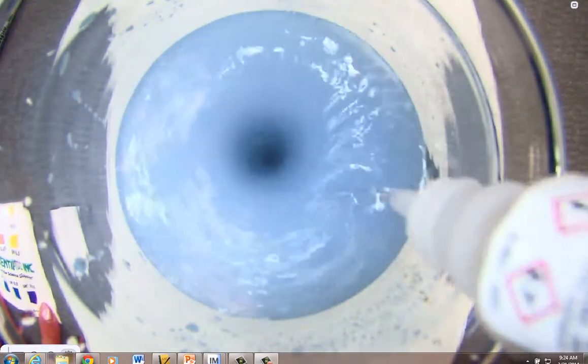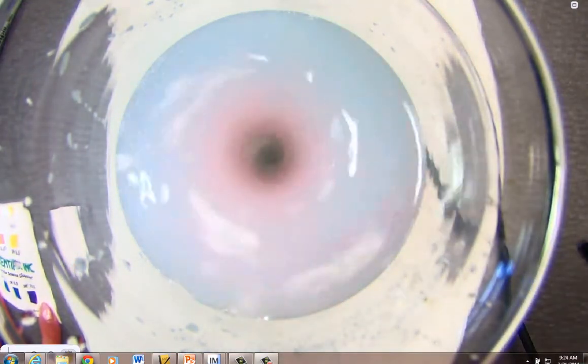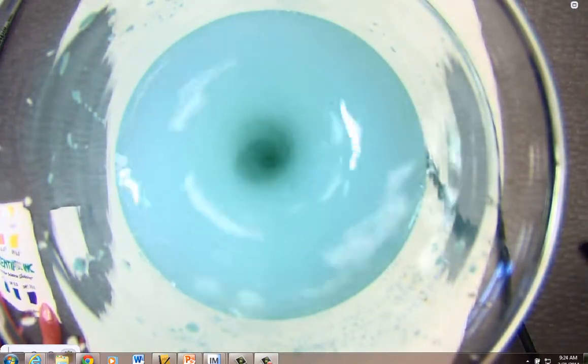Upon immediate addition, notice the reds. From the red, we get to the greens, and from the greens, we get back to blue. Addition of acid: I see the appearance of reds, greens, and back to blue. Reds, greens, and back to blue.